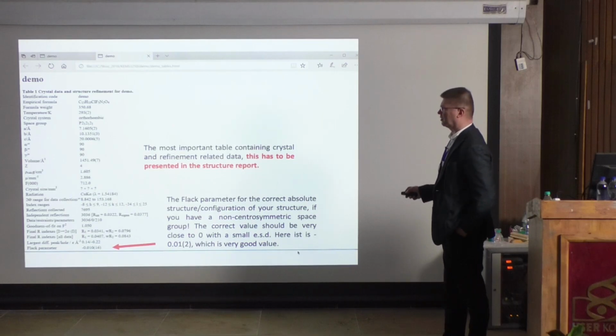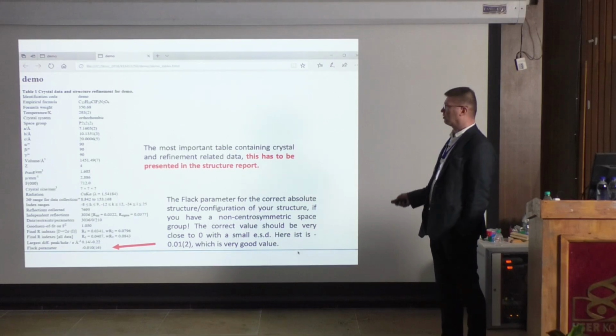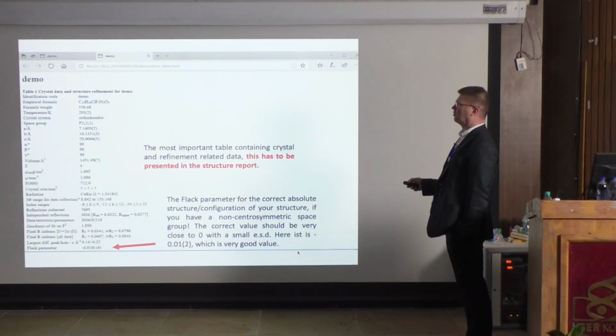So typically this information now is given in SI. Depending on, sometimes you might report these also inside the paper, but typically it's not needed. So the most important is the crystal refinement data. And here what it tells us: name, the chemical composition, molecular weight, temperature, where it's done. Now crystal system orthorhombic space group, this is very important.